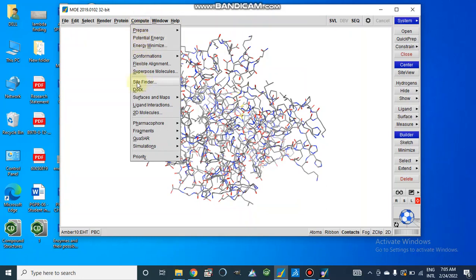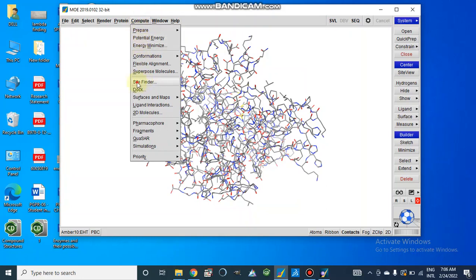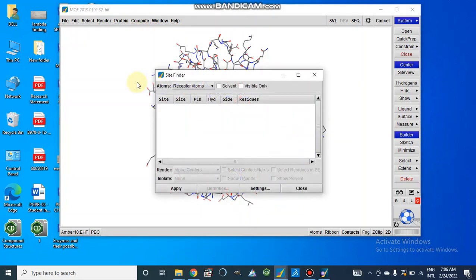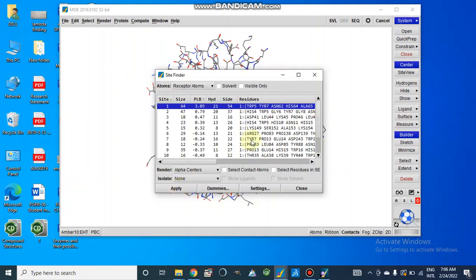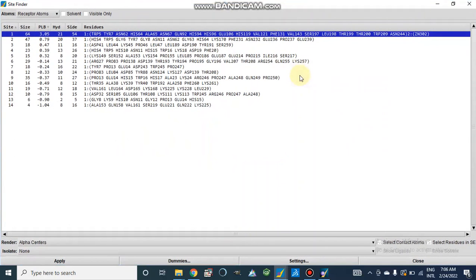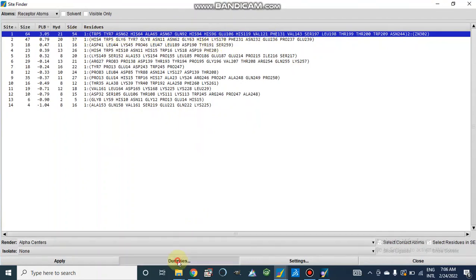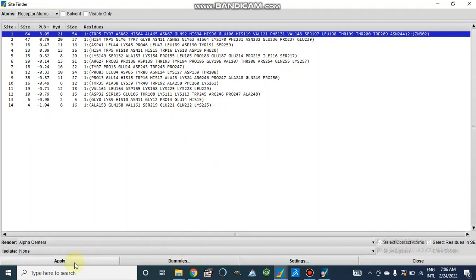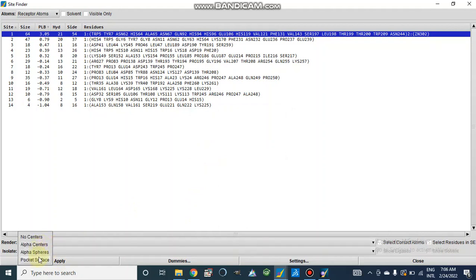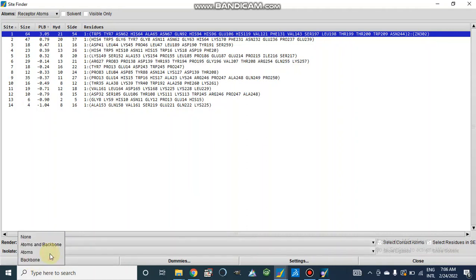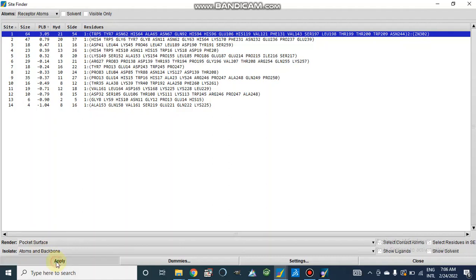So here go to compute, site finder, and again apply. Now we can apply alpha centers, alpha spheres, or pocket surface. We want to show our active site. And here we will isolate atoms and backbone and then apply.